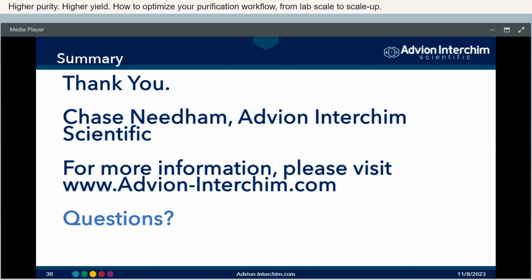All right, so we've already got some great questions coming in here. This first question that I have for you, Chase, asks, can I use the XS520 for both normal and reverse phase purifications?